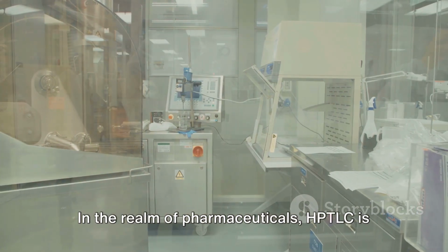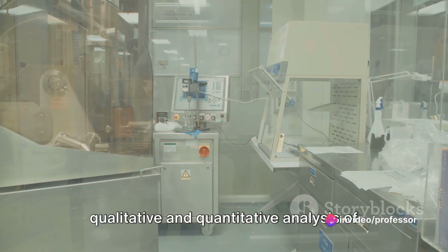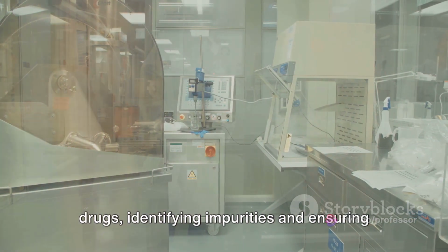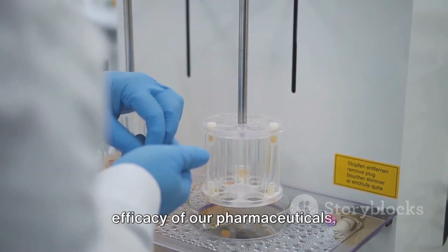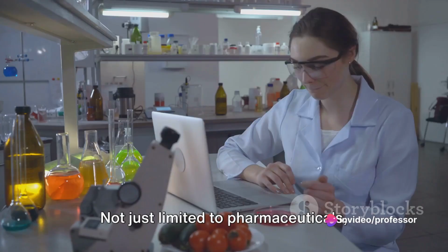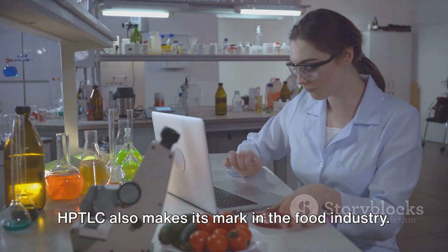In the realm of pharmaceuticals, HPTLC is a trusted ally. It plays a critical role in the qualitative and quantitative analysis of drugs, identifying impurities, and ensuring the quality of medicines. By providing accurate and precise results, it helps maintain the safety and efficacy of our pharmaceuticals, ultimately protecting public health. Not just limited to pharmaceuticals, HPTLC also makes its mark in the food industry.